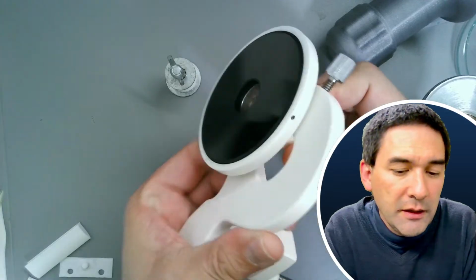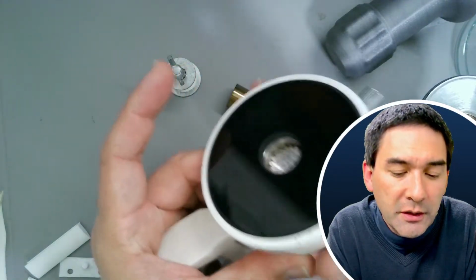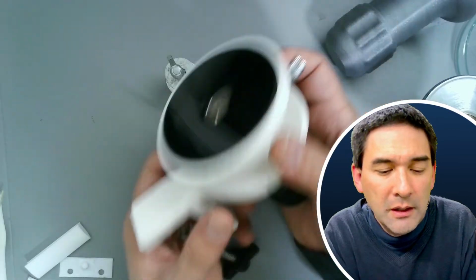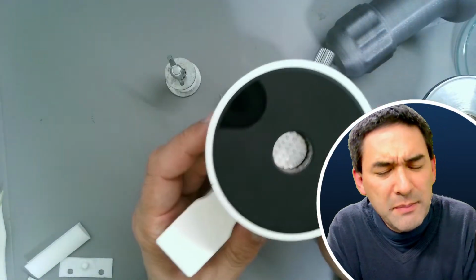Can I even get it in there? Oh no, I can't get it in. Yeah, here we go, it goes in here. Okay, and then I can tighten it, and then I can mount it on the table. Very stable, very solid. It wasn't even that expensive, I think.